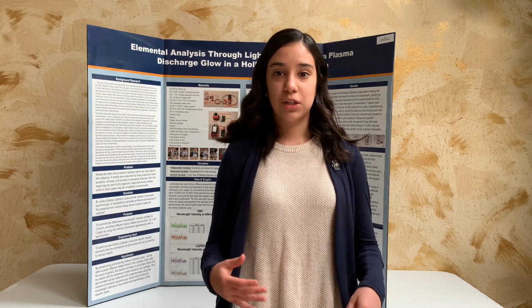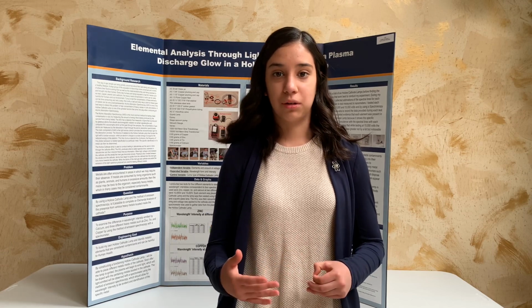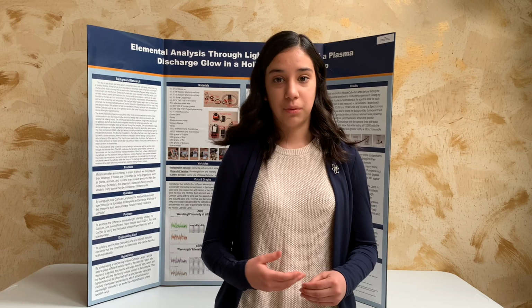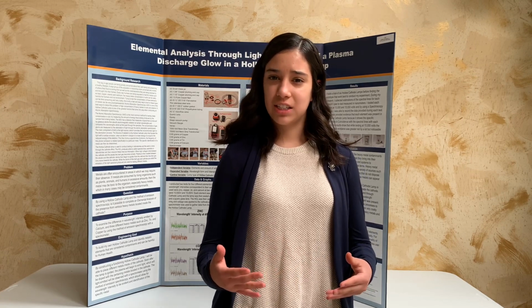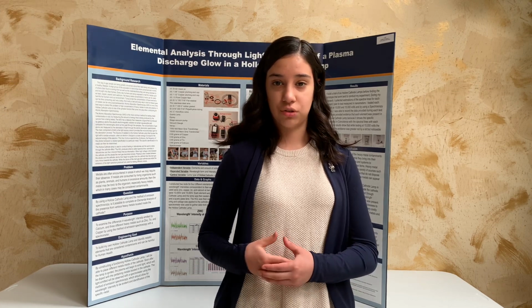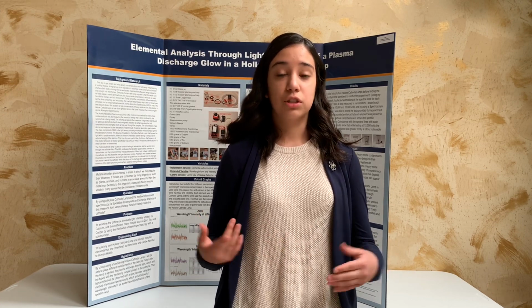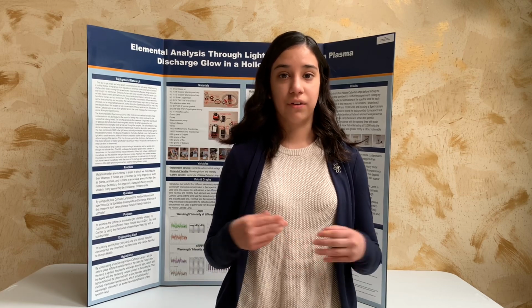And eventually, as we consume these crops, we are being exposed to these harmful metals, and eventually they are making their way into our bodies. So this is why it is important for scientists and people to be able to identify what heavy metals are contaminating various soils. This is why the use of spectroscopy and the use of hollow cathode lamps are very important.